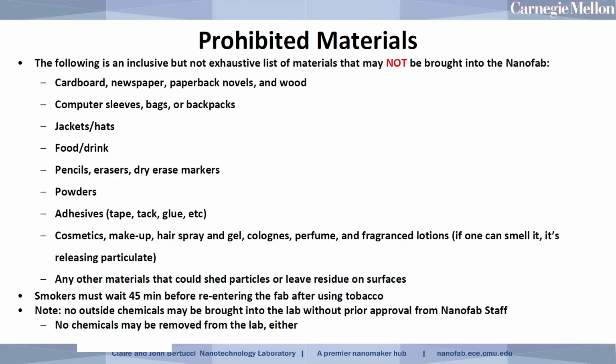So if you do have a need for a chemical that's not stocked in the lab, that's not available in the lab, please contact us, because we want to know about that before you bring it in. And if it's a new material, we want to know and have that discussion prior to you even ordering it. Okay, so this is something that we need to abide by in terms of being in compliance with EH&S.